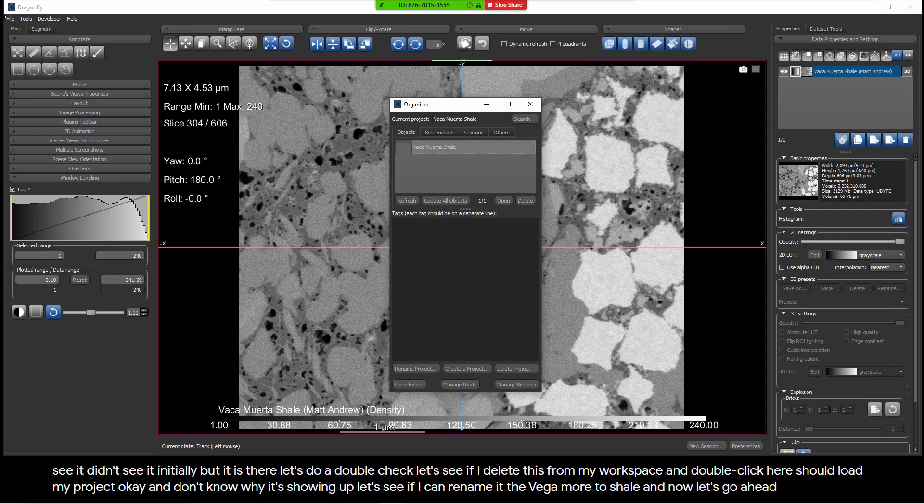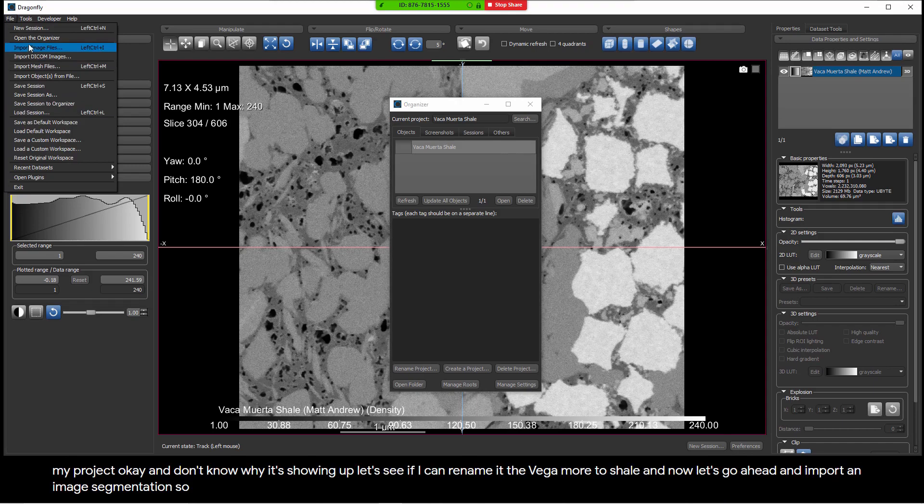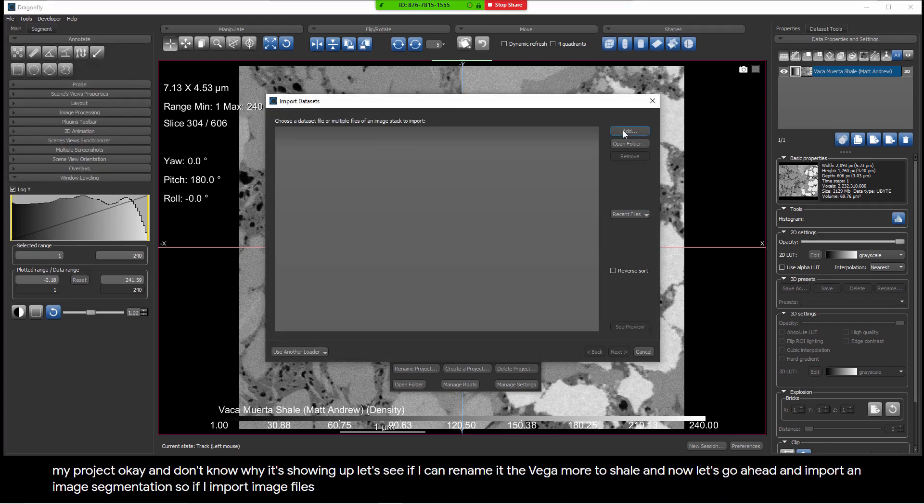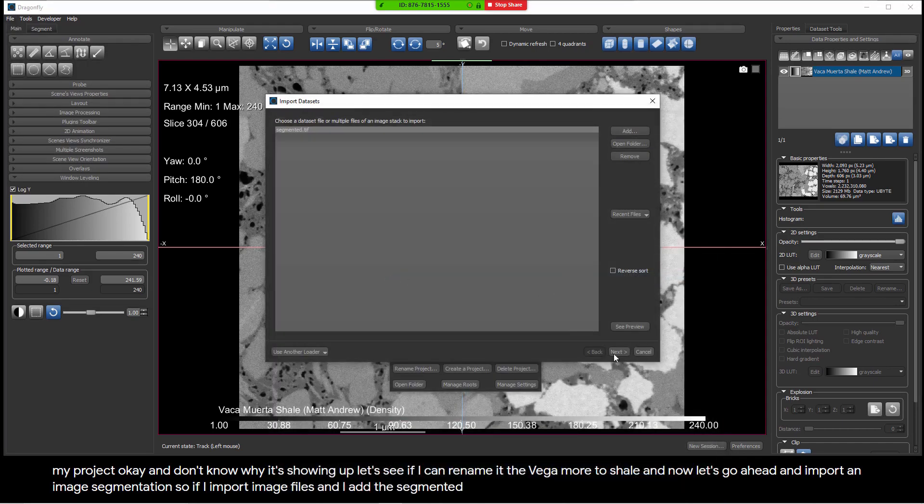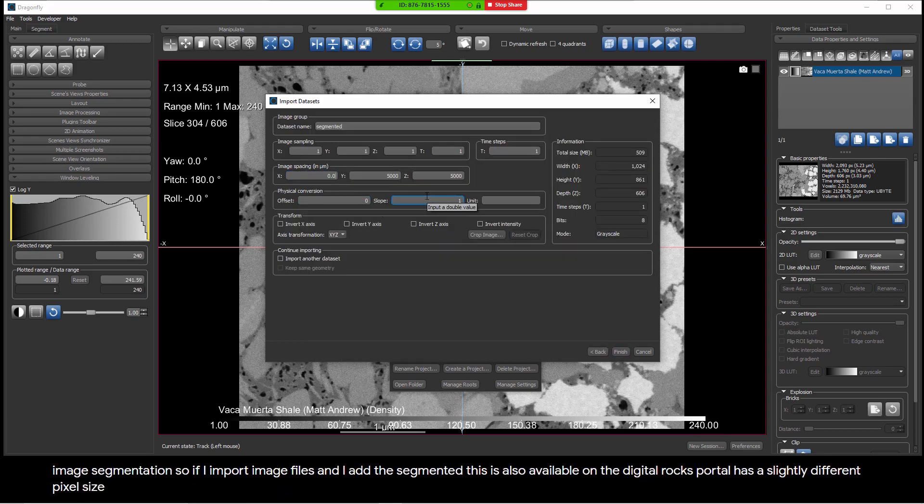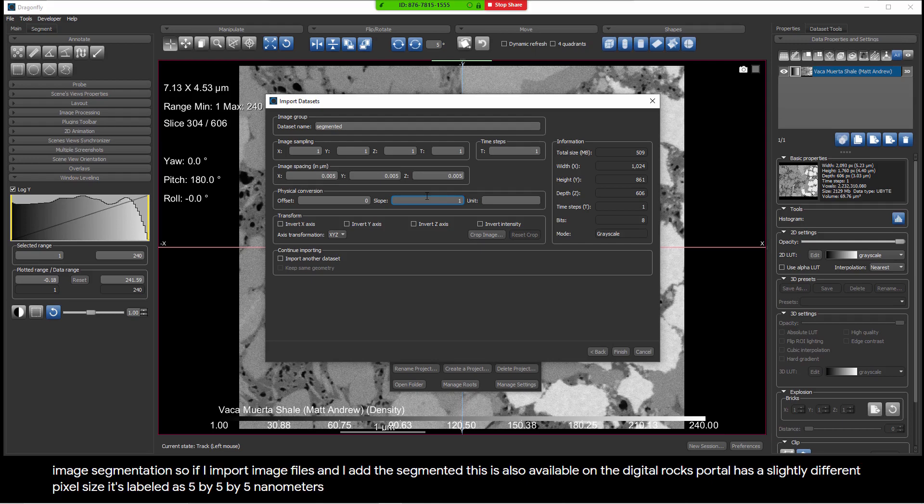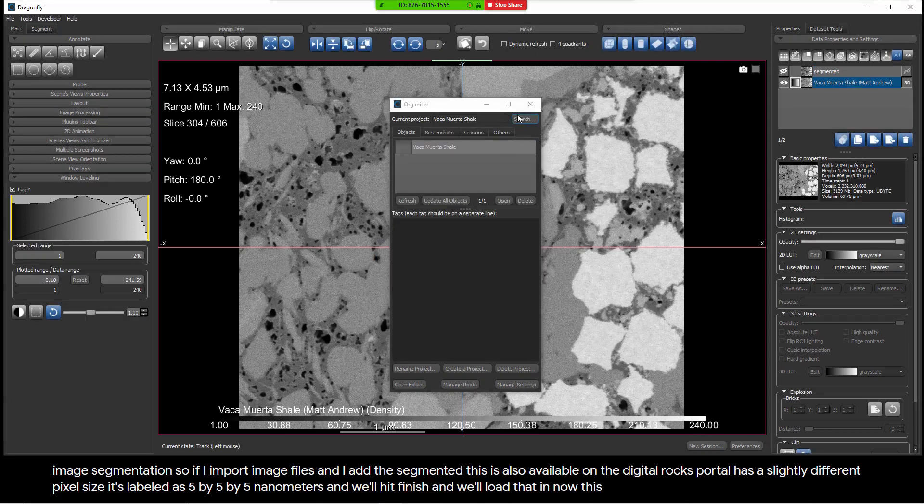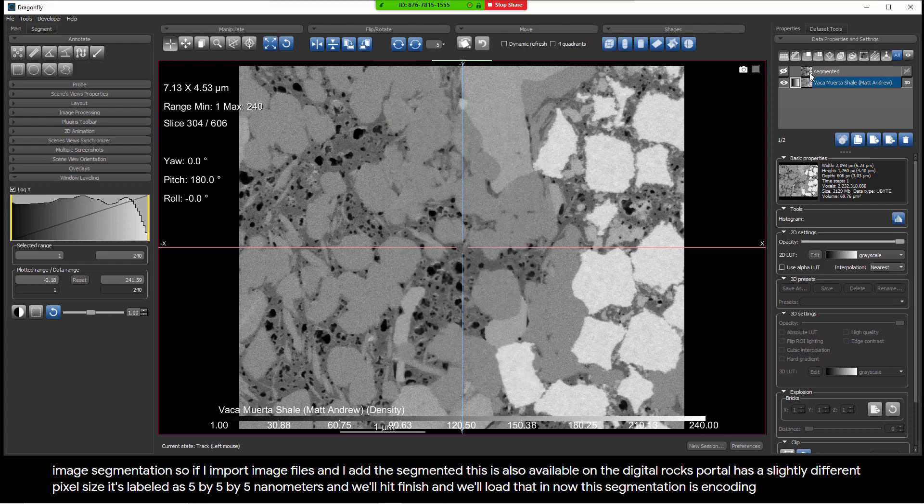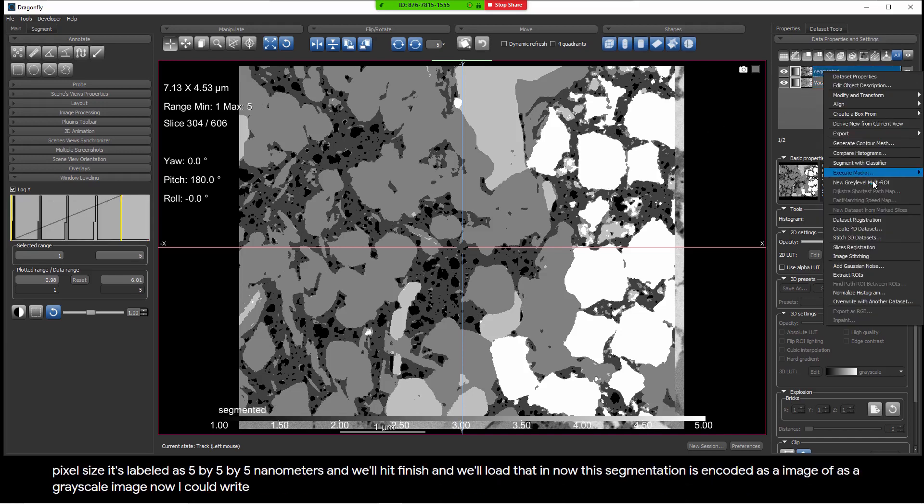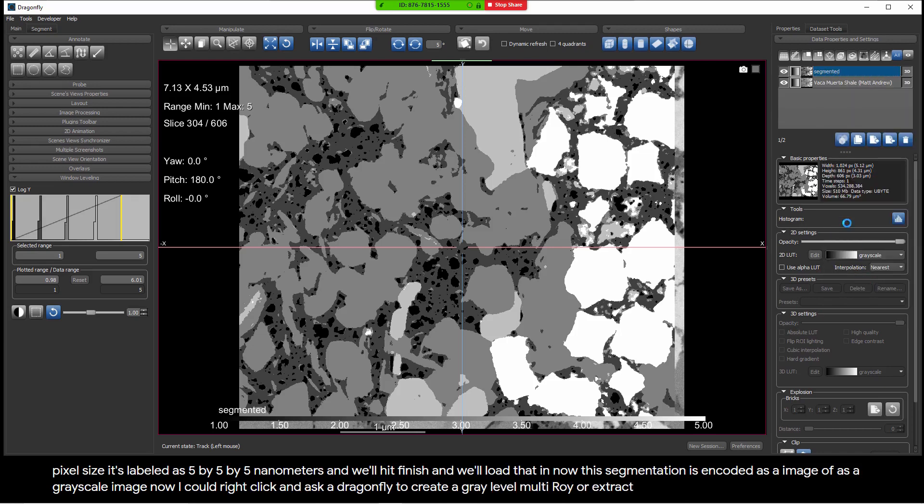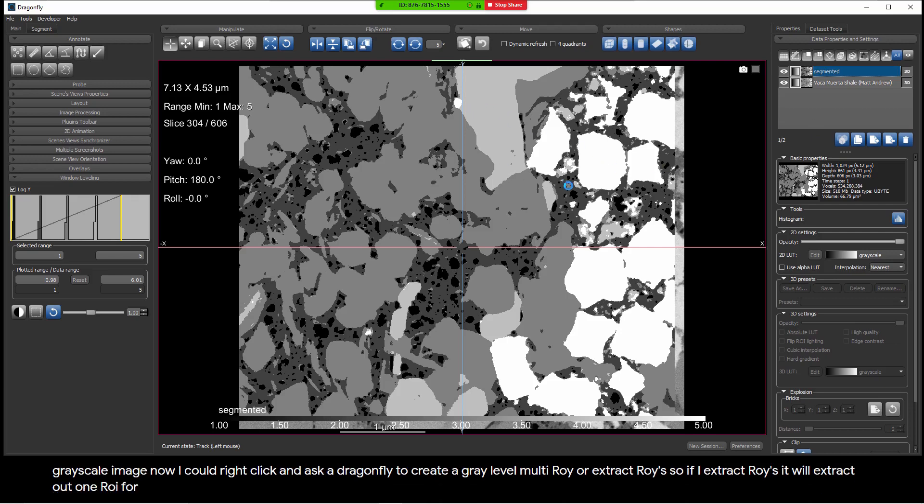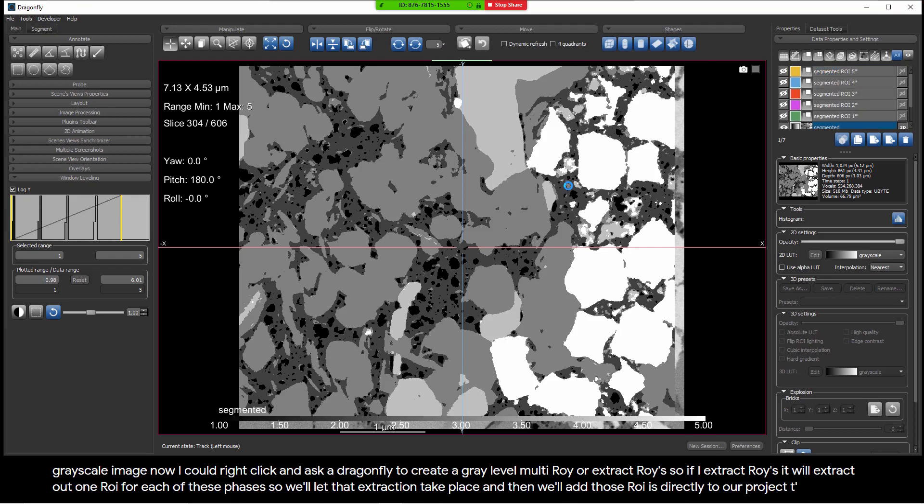Now let's go ahead and import an image segmentation. So if I import image files and I add the segmented, this is also available on the Digital Rocks portal. It has a slightly different pixel size. It's labeled as 5 by 5 by 5 nanometers. And we'll hit finish. And we'll load that in. Now this segmentation is encoded as a grayscale image. Now I could right click and ask Dragonfly to create a gray level multi-ROI or extract ROIs. So if I extract ROIs, it will extract out one ROI for each of these phases. We'll let that extraction take place. And then we'll add those ROIs directly to our project.